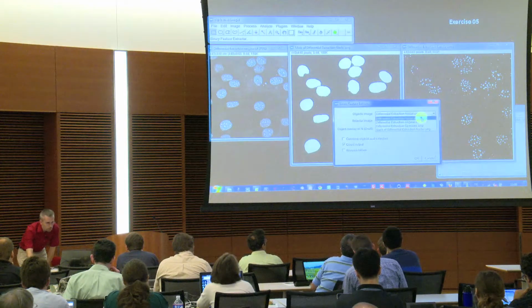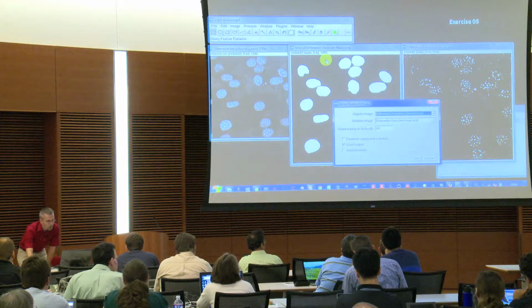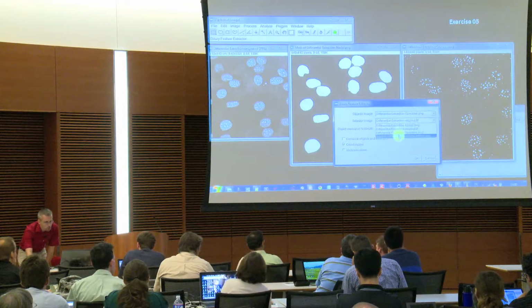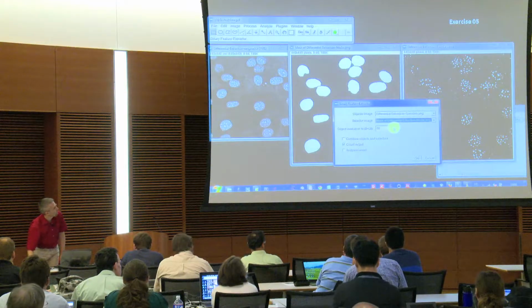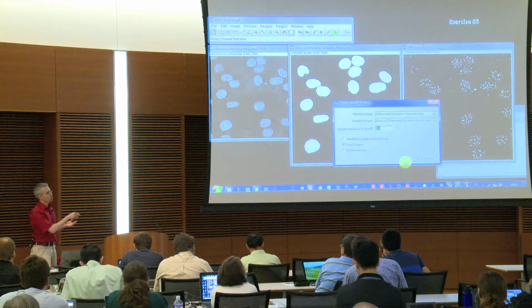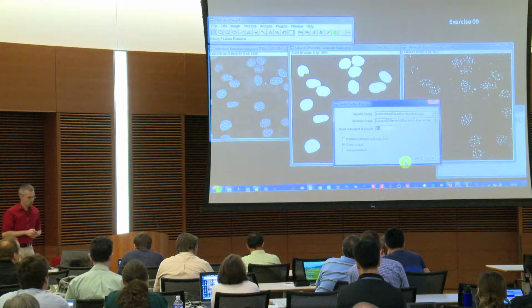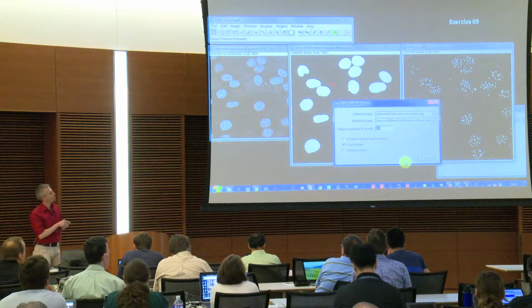So this means I need to select the image which has the name differential extraction speckles. My selector is my analyzed image, my mask image, so mask differential extraction nuclei. Then normally I want to have all those spots which are touching those ones, or which are completely inside, so basically which are covered by this one.